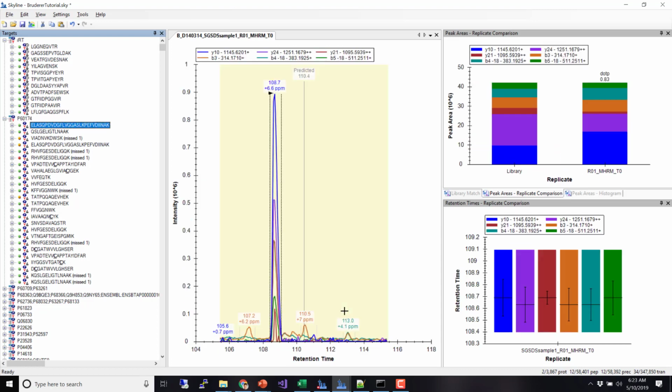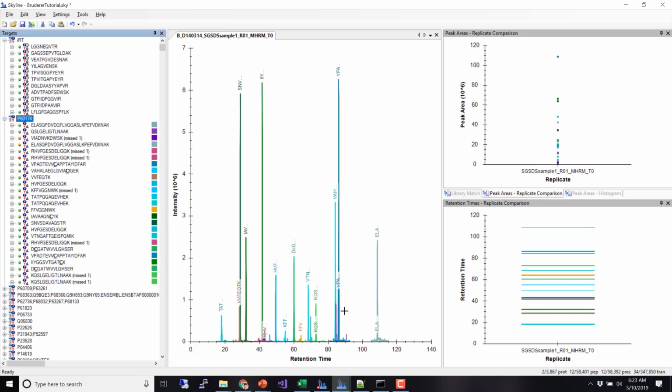And then let's take a look at some of these other things. First of all, if you look at this first protein, you can see all the peptides. If you just select a protein, you can see all its peptides. Before we created this graph, Paola Piccati showed something like this in a presentation, and I was like, wow, we need to do that. And she called this the protein fingerprint.